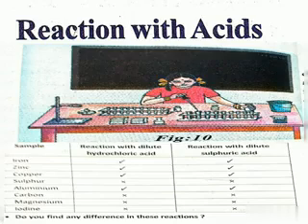Here we took the samples in test tubes and added HCl. In place of HCl we can take H2SO4 also, and heat it or otherwise observe the reaction. So in the place of HCl we can take sulfuric acid also.